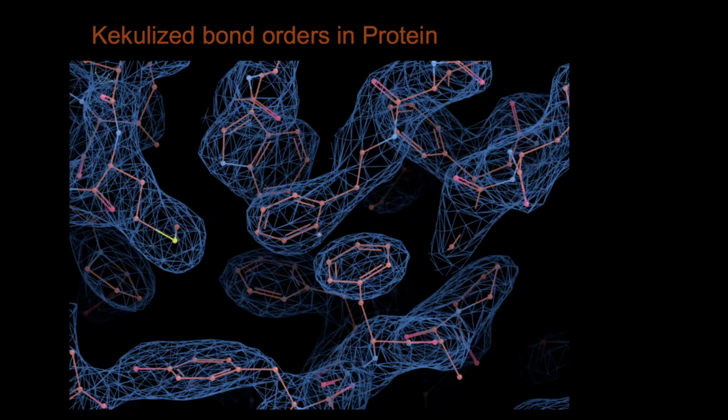Right, and yes, you can see that it's taken the aromatic description of the amino acids and used the bond orders there to represent the chemistry. And I think it looks nice now. I didn't think it would, but there we go. I hope you find it useful. It can be found in the color by chain option in the display manager.